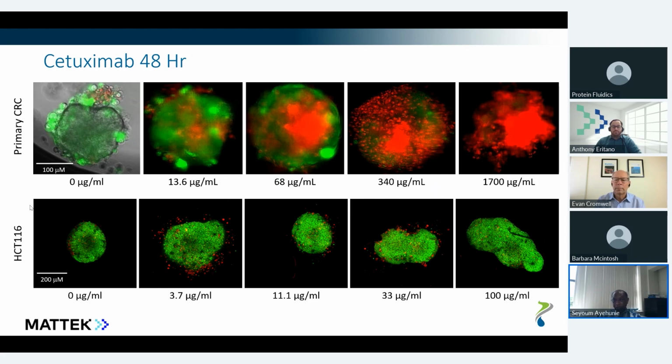Those are the type of things. But we are now working with only tumoroids over here, and we need to make sure that this type of response happens in a microenvironment where the tumor is grown. I will show you one more example where we have basically started to incorporate these tumoroids into a 3D tissue model, which makes it more similar to the human microenvironment. Next slide, please.